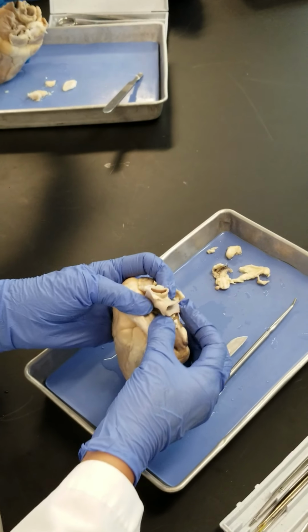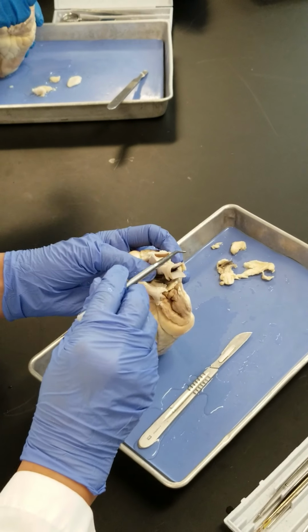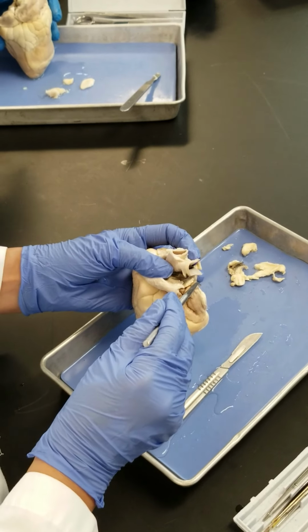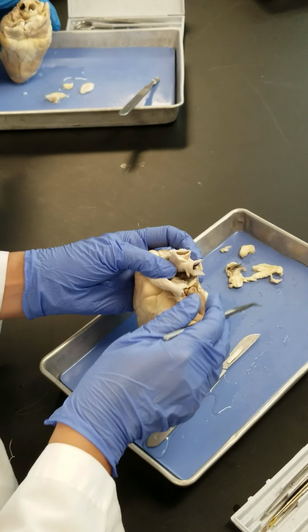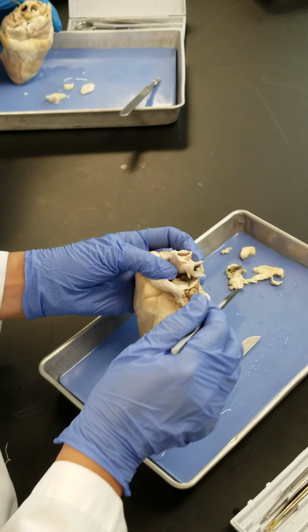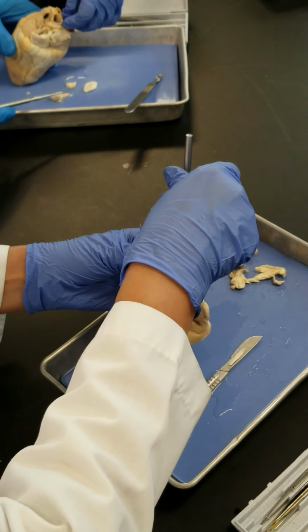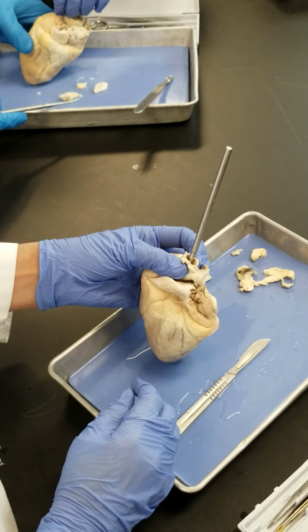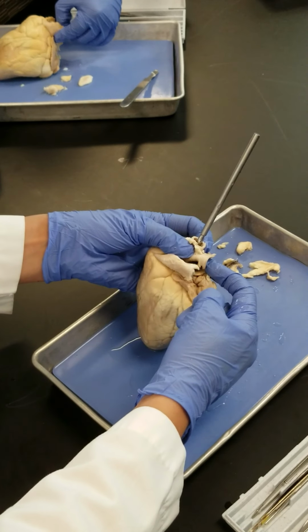So here you see that this is the arch of the aorta that has been cut here. If it hadn't been cut, you could see the other two branches of it, right? Sometimes in some of the hearts they have been cut further, so you may see the other branches. But here you have only one branch. This one goes up toward the head and neck on the right side, right? This is the brachiocephalic trunk. This is the aortic arch.